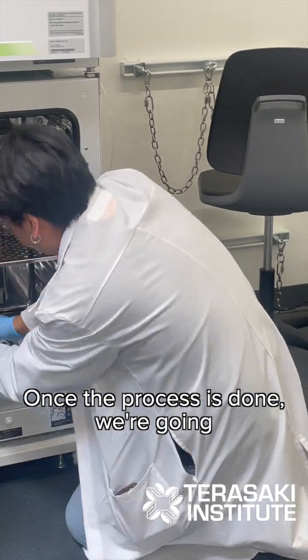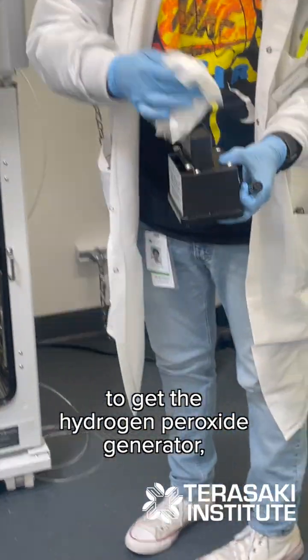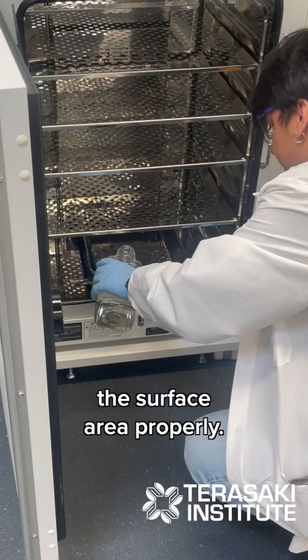Once the process is done, we're going to get the hydrogen peroxide generator remover and clean all the surface area properly.